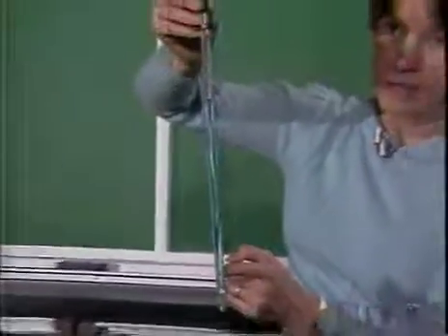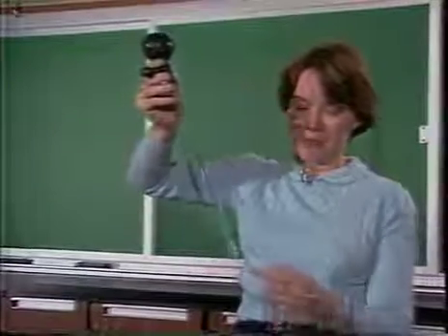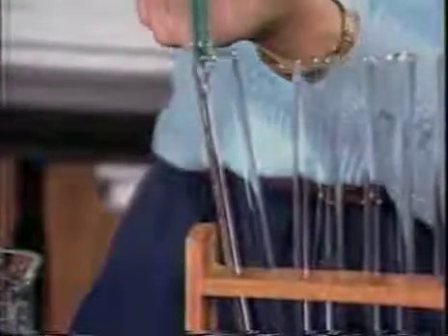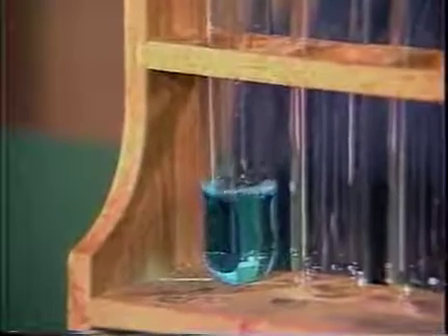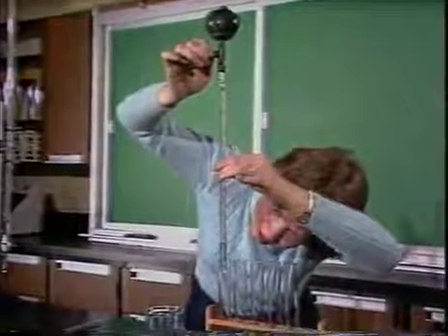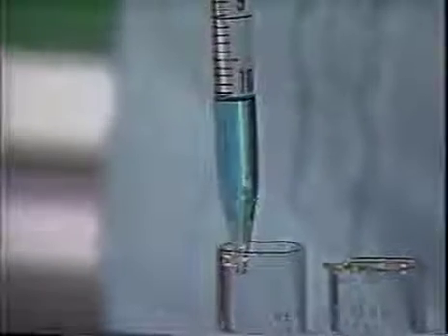If I wish to deliver 10 mLs of fluid to this test tube, I then place the pipette over the test tube and push E for empty. As I do this, you can see that the liquid starts to run out of the pipette. Again, I have to watch at eye level, stopping the pipette when the meniscus rests exactly on 10.